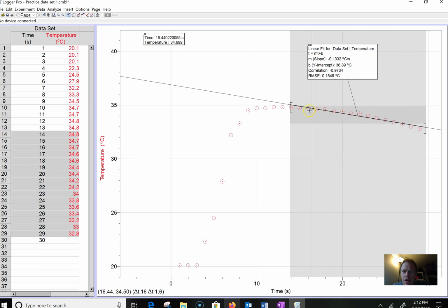So we're going to make a couple of assumptions. That linear rate of heat loss has been happening through the whole experiment. And we're also going to pretend that this reaction happens instantaneously. And so this line, this little circular line, you see that I'm moving up and down right now and is tracing along the best fit line. What this could be used to do is extrapolate forward and backward in time.